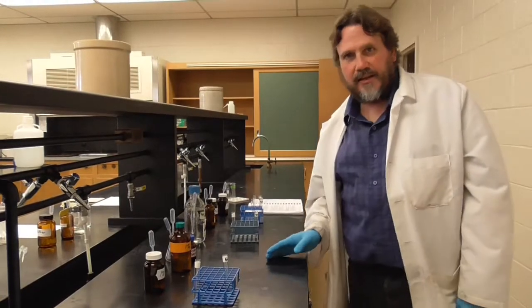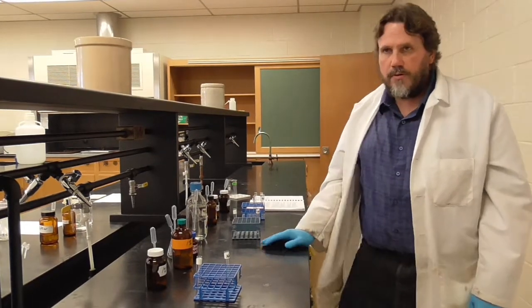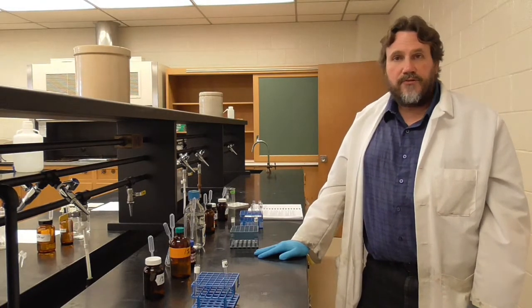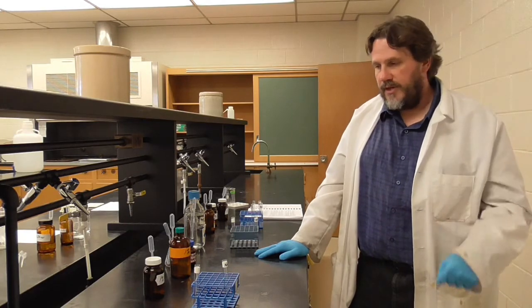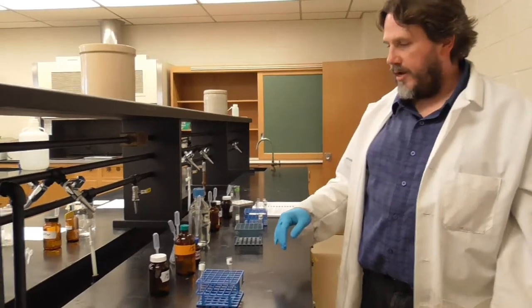Okay, part E, our last part of the enzyme experiment, we're looking at inhibitors. So inhibitors are other molecules, chemicals that inhibit an enzyme from working, that interfere with it or block it or somehow turn that enzyme off so it does not function. We're going to test a couple different things to see if any of these are inhibitors for our enzyme amylase.